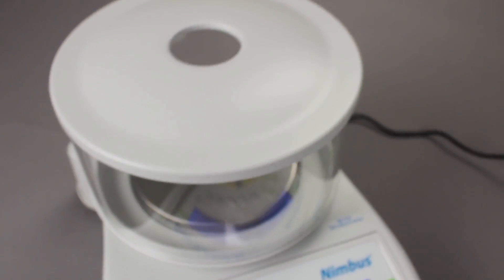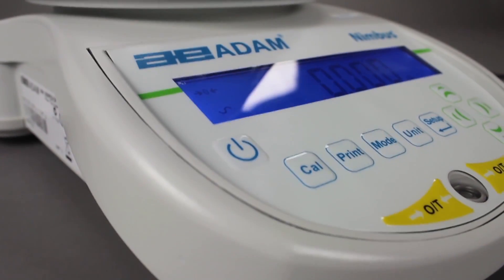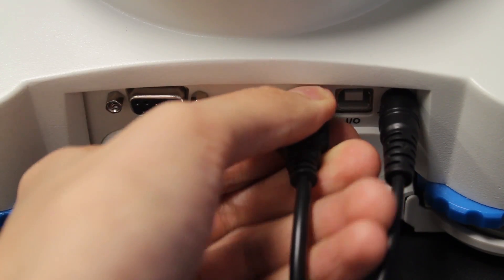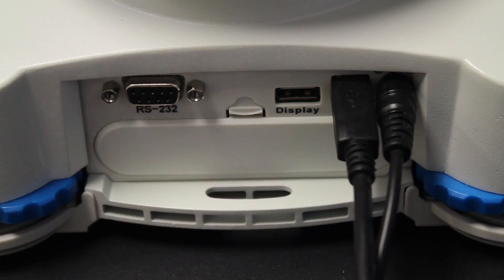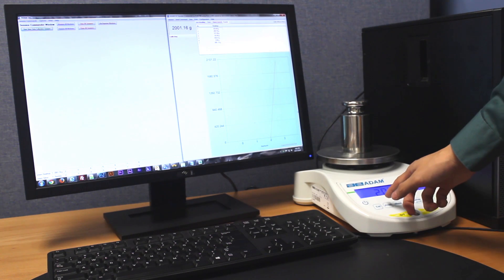The solid metal housing provides a stable base for outstanding precision weighing in labs or variable field environments. The Nimbus features both USB and RS-232 interfaces for connecting to computers and printers, to streamline data collection and analysis.